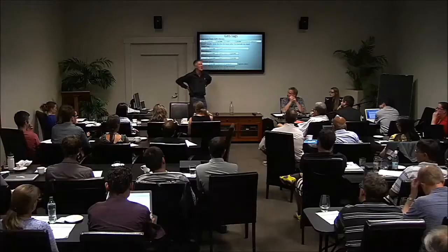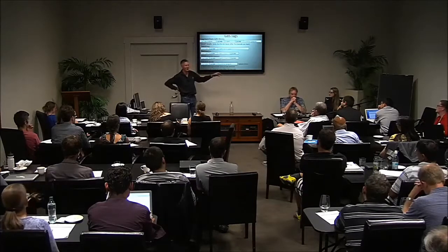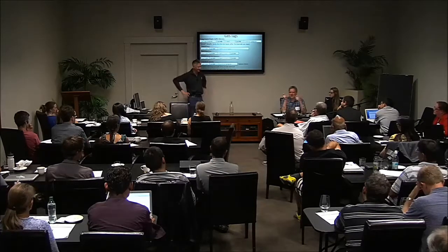And that's the other thing. A lot of times Katie says, when she's talking about this, well, does it matter? If it's random, it'll generate some tag that's only seen once or something, and then it'll be filtered out. So I certainly haven't measured that.